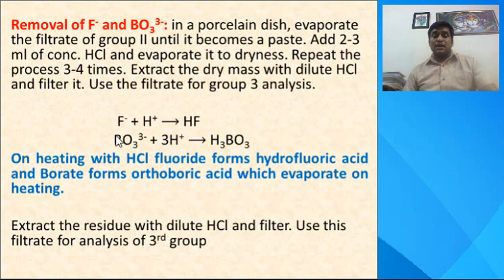In this case, the fluoride and borate present in the mixture, if we heat them in the presence of acids, form hydrofluoric acid and orthoboric acid, which are volatile. We can evaporate them and they go off from our mixture, and that's how we can remove them. Since they are removed, the residue can be extracted with dilute HCl and filtered, and the filtrate can be used for third group analysis.